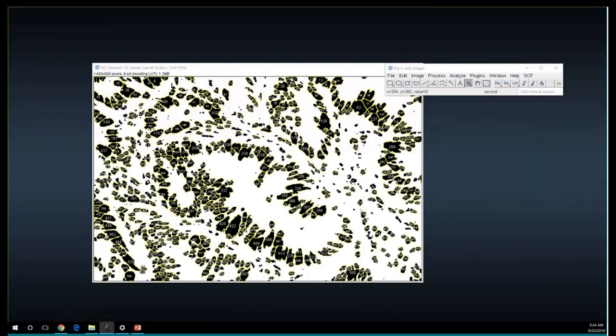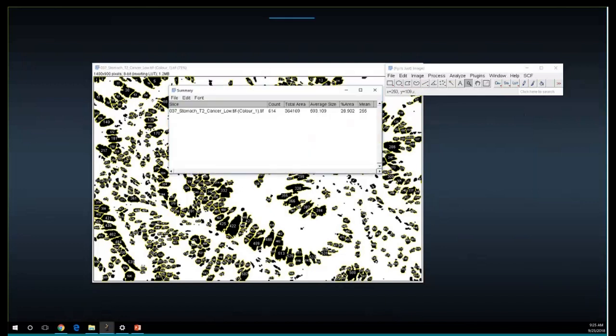It's going to count all the nuclei for you. You can see the smaller ones didn't get included based on my criteria. We can increase or decrease that based on the visual inspection between this image and the original image. And in the results, a new window will show up, and one of the results will be here, 614. The count is 614, which is the count of the objects or the particles within the image. In our case, the count of all the nuclei within the image.